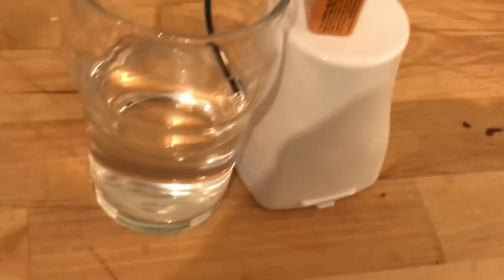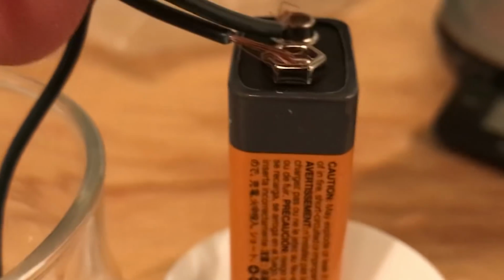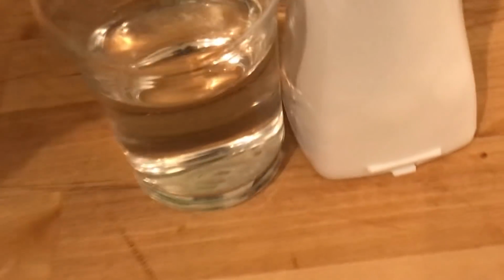Now I just need to get my lighting apparatus to come in contact with the solution. It is indeed submerged. Both terminals are in contact and no lighting. So there's a molecular compound that won't light up the lights.